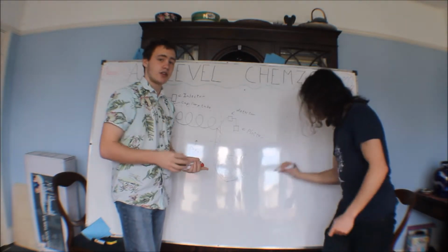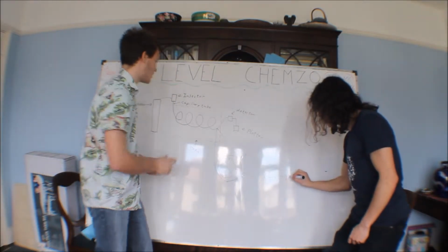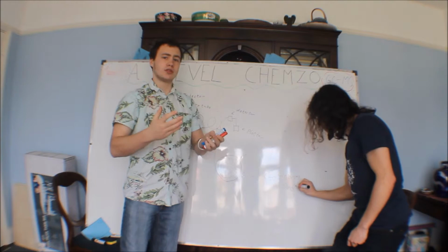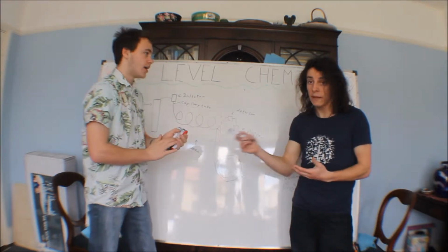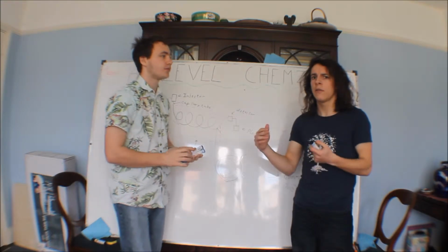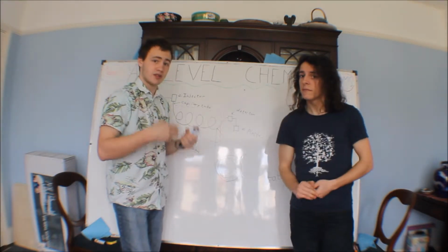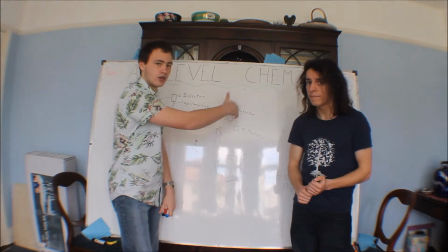Now this can actually be a solid or a liquid. If it's solid, as the gas goes through here, it's going to be adsorbed onto the surface. It's adsorption, not absorption, and that's important. That will slow the different things by different amounts, making different times in the detector. So if it's adsorbed more onto the surface, it's slowed down and will take longer to go through.